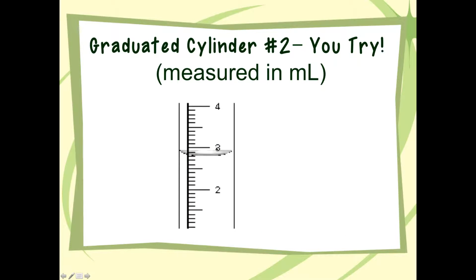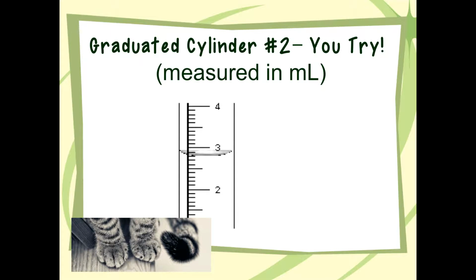All right, here's another graduated cylinder. You go ahead and try this one. Pause the video before you hear the answer. This is measured in milliliters. Go ahead and try it.